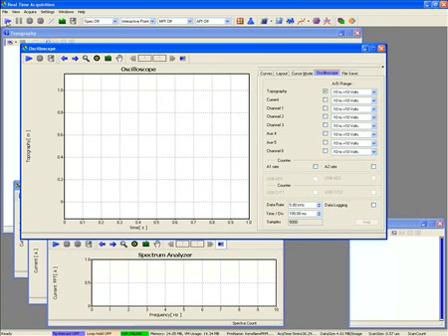Many of the controls remain the same, such as the pause button and the stop buttons. But we've added a new control to the toolbar, and that is our spectroscopy within an image settings. For example, from the main toolbar, we can now choose to run an IV spectroscopy in a grid within our image during acquisition.